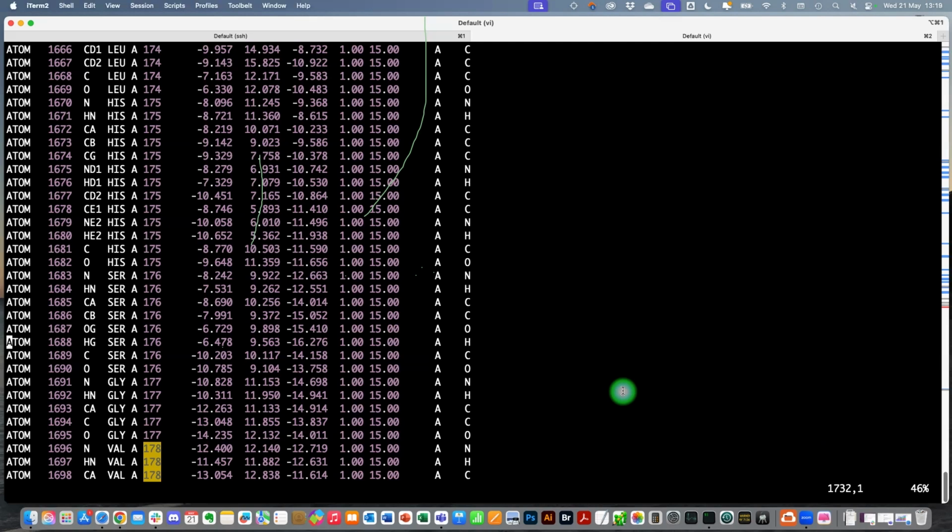So we have MPI mode, we have a local mode, which is what we use, and we have what we call the batch mode, where you will be starting HADDOCK interactively, for example, and it will be sending to Slurm. But then it sends a lot of small jobs to Slurm. So the HPC system administrator will not be happy with you if you run HADDOCK3 in that way. So that's not the best way to run. But we have not yet a grid mode.